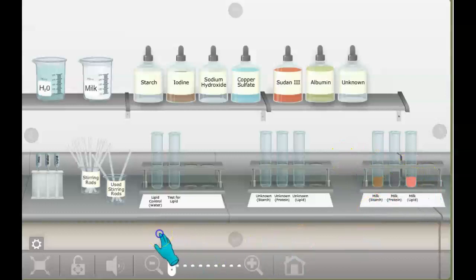All right, I think that's it for the PreLab. You don't even do this part for the PreLab. I'm just stepping ahead so I can just do the different lab with you later.